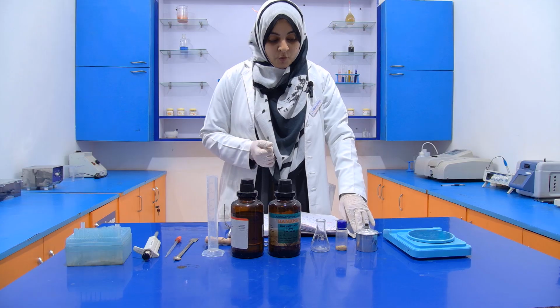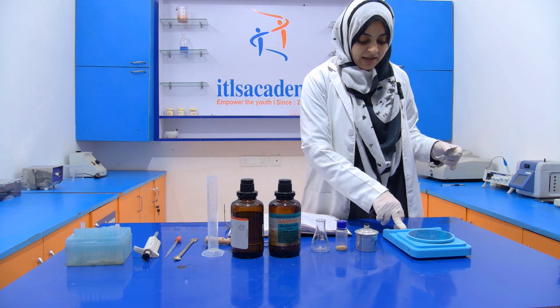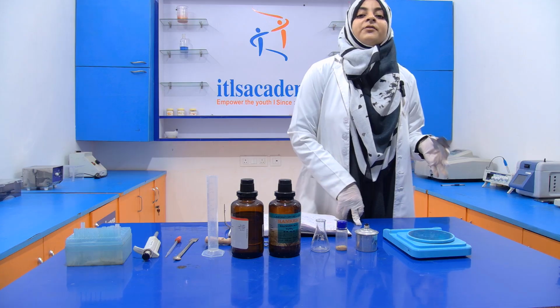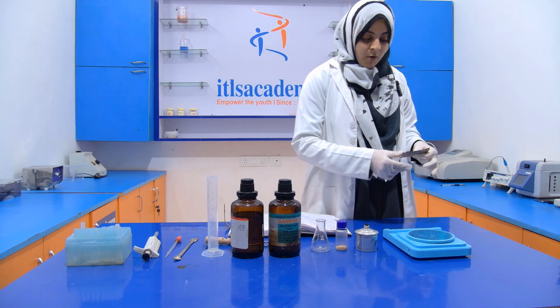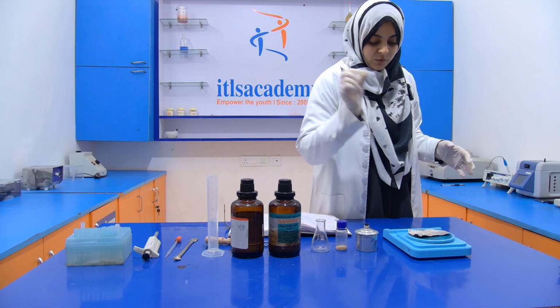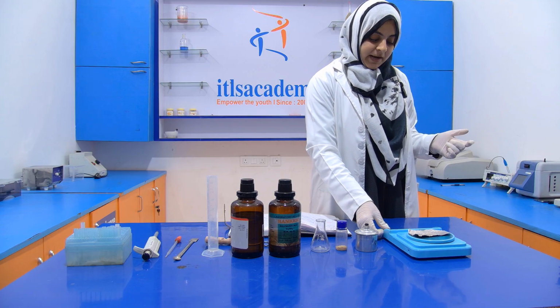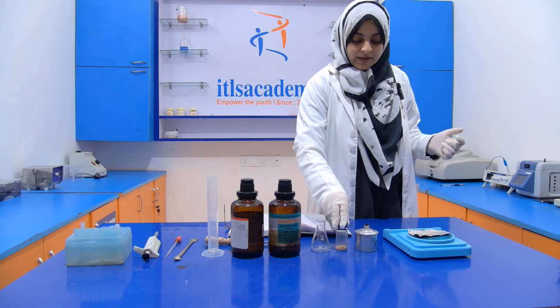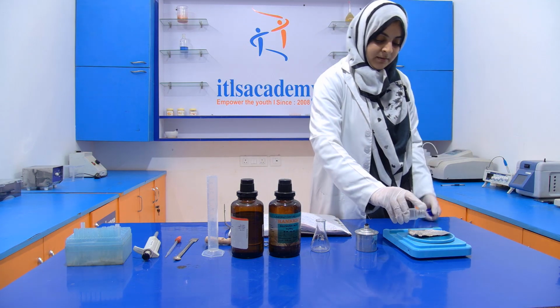What we have to do, we have to take 0.5 gram of asafoetida, and the weight will be taken with the help of this weighing balance. Now, put that aluminum foil onto the weighing balance, and don't forget to tare the weight of the aluminum foil. Now, add 0.5 gram of asafoetida into it.